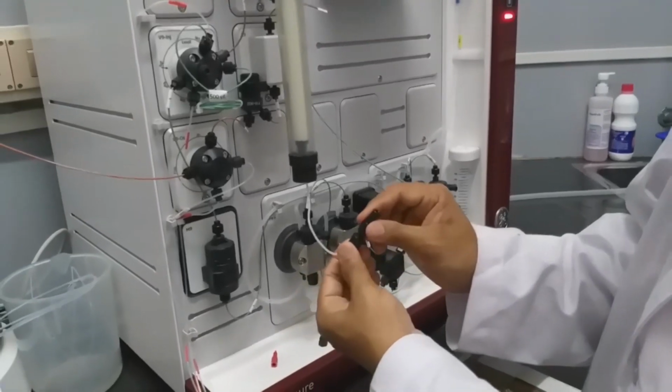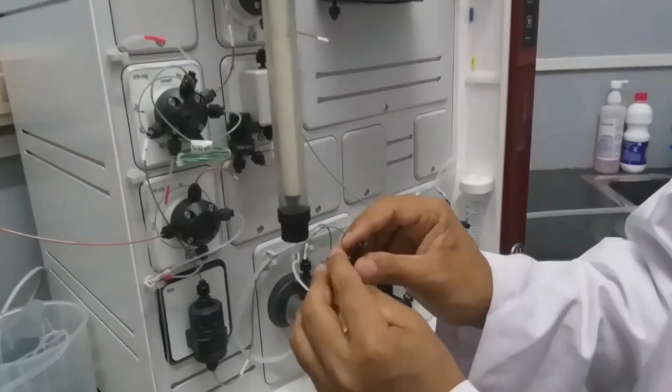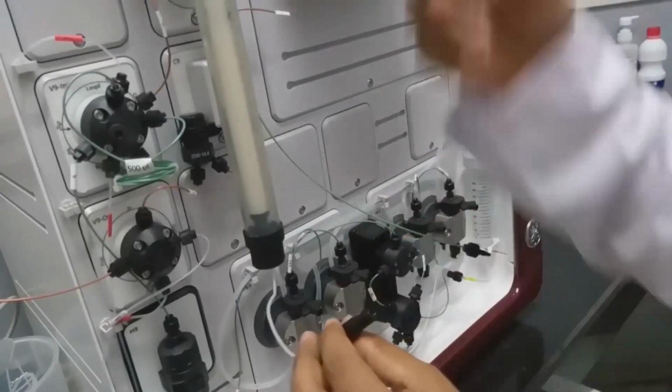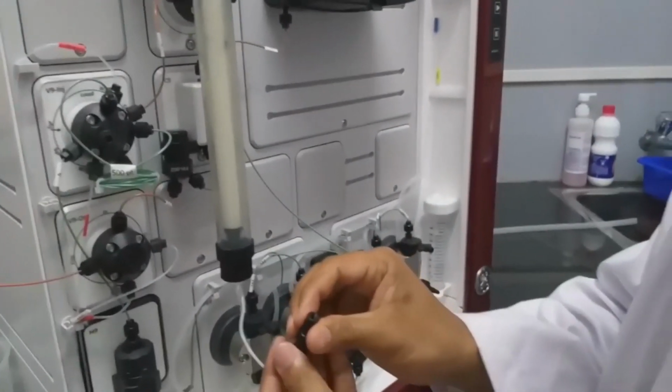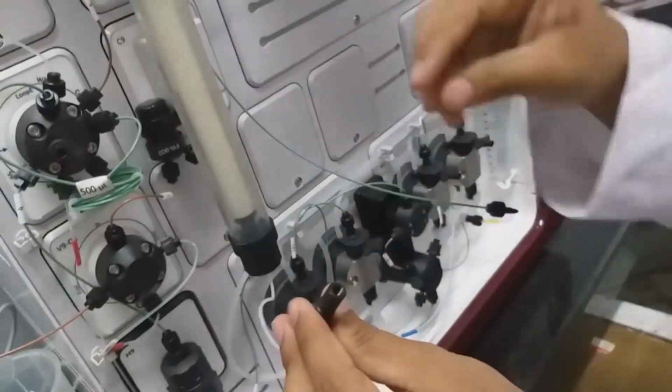So here, this is the bottom portion. You can see the buffer here if the buffer is passing through the column. As we can see, there is a fill up of water in this.